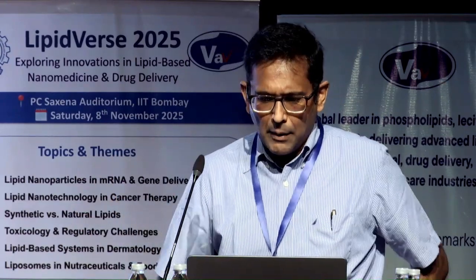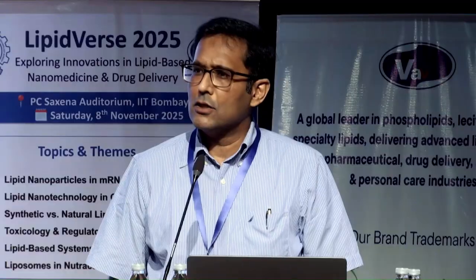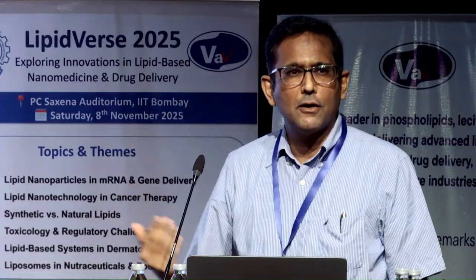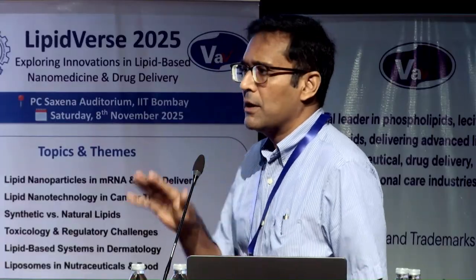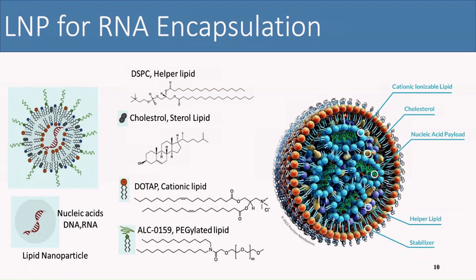And then only a year back, as I said, Rakesh joined my group and he wanted to take this further, but really try the encapsulation bit. And these are the very initial experiments, very preliminary experiments that I'm going to talk to you about. And the idea was, of course, to try and see if this technology or simple method could be used to encapsulate RNA. And so we took a mixture of lipids, as this is very well known now. We had the DSPC as a helper lipid, cholesterol, to give the mechanical stability, a cationic lipid, and a pegylated lipid.